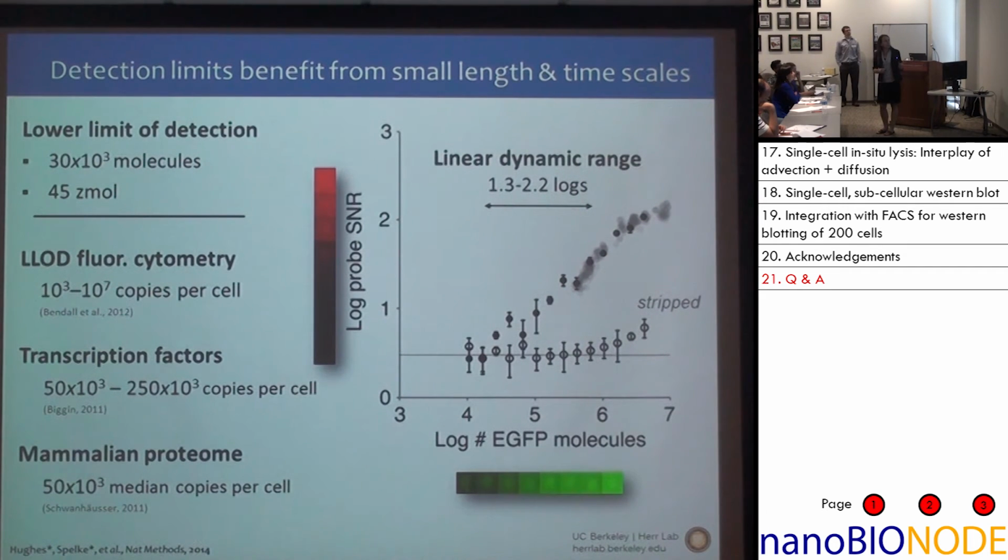Okay. Further, we've done some analysis of the mammalian proteome, and our numbers, and there's a little bit of debate in the literature about the dynamic range of expression in that proteome, our numbers show that with the assay that I'm showing you here, we should be able to measure about 80% of the proteins in the mammalian proteome. So the lowest expressing 20% of proteins we cannot measure with this approach yet, but the top 80% we can.